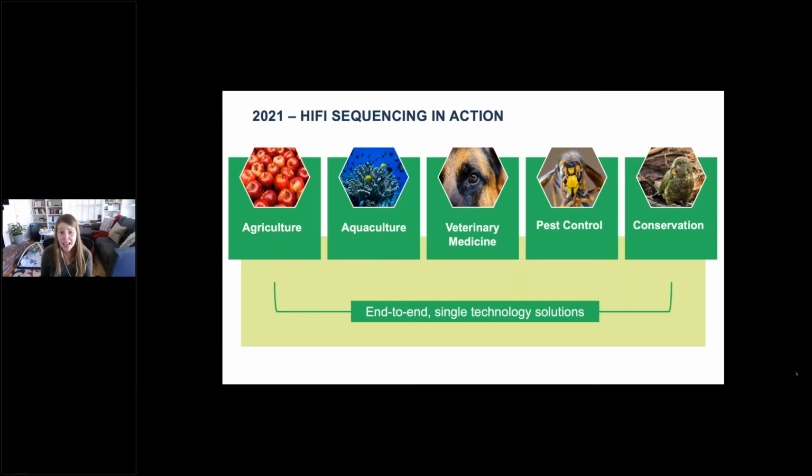There's really a way that HiFi sequencing can help in all of these efforts.